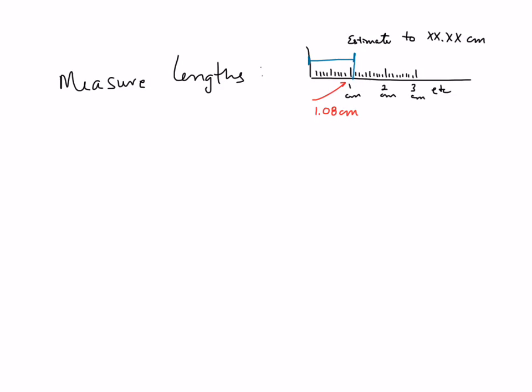So today we're going to be talking about density, again, like we talked about in lecture yesterday, and I'll remind you what that is in a minute, and we'll be finishing up that part in lecture tomorrow. But you're going to be measuring some things, and like we talked about in lecture, we're going to make you measure between the gradations. I know it sounds kind of trite, but if you've had a chance to look over what you're doing first, you're actually getting the 3 dimensions of these blocks, color of your choice.